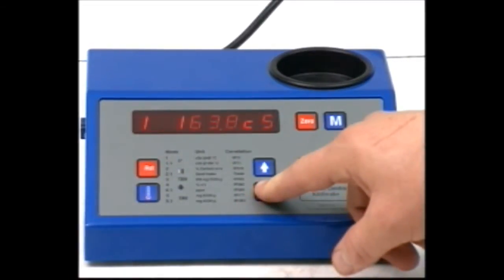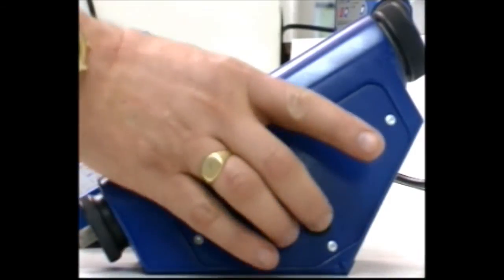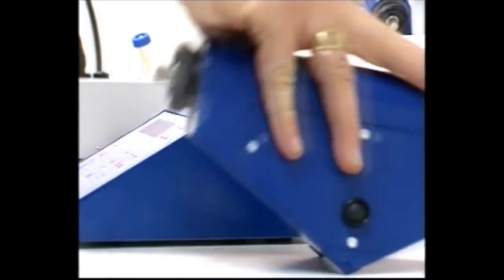For more accurate results, several readings can be taken over a period of 5 minutes. This is important if the oil is a lot hotter or colder than the viscometer. Simply press the power button and repeat the tilt procedure.